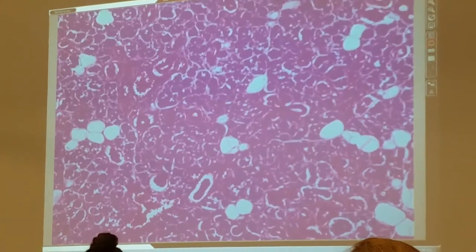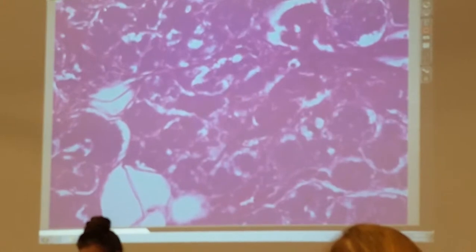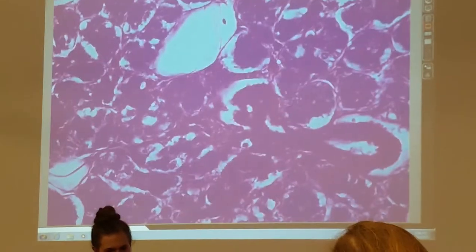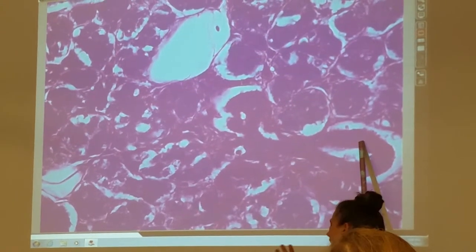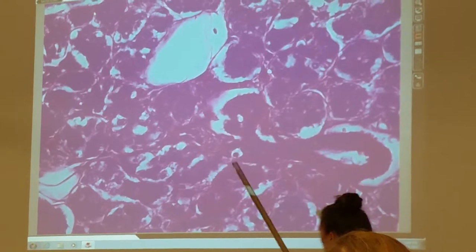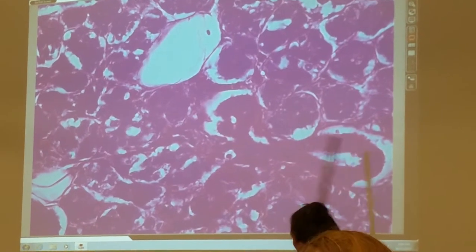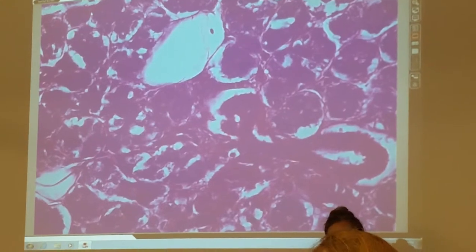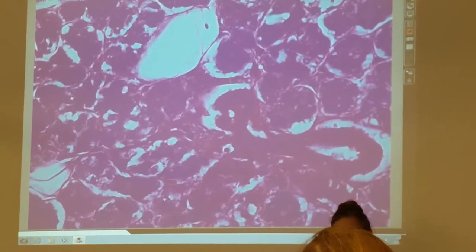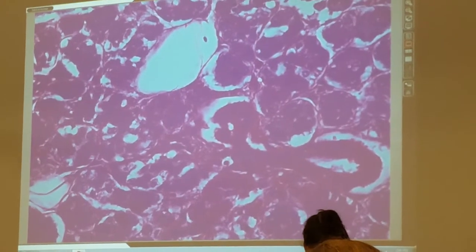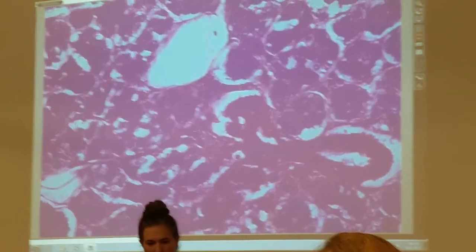And if I were to ask you what any of these structures are, right here — that is, I know the brightness isn't that great, but you can see, if you were looking at the computer screen or in the microscope, you can see the nuclei lined up. Remember, any duct is going to be that uniform simple cuboidal epithelium lined up, nice nuclei lined up right there, and there will be some type of a lumen, some type of a space found there. So since this one follows, that's kind of a good comparison here.